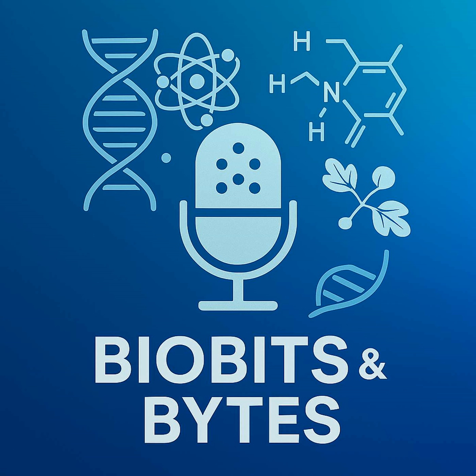Okay. Now, getting that probe to stick correctly, it seems like things could affect that. Oh, definitely. Hybridization is sensitive. Things like the salt concentration in your buffer, how thick or viscous the solution is, how long the probe and target sequence are, how many mismatches there are between them. Even just the ratio of different bases, G's and C's versus A's and T's, can affect how strongly they bind. You have to optimize the conditions.